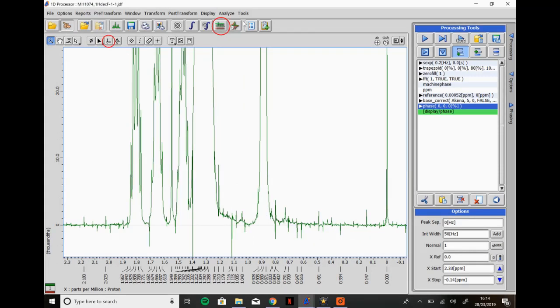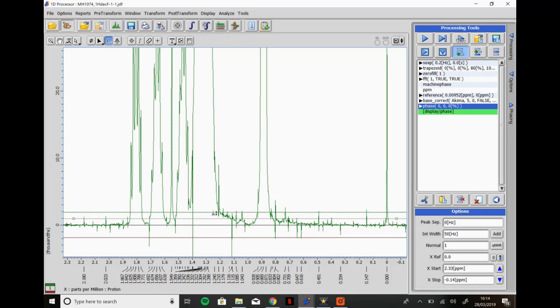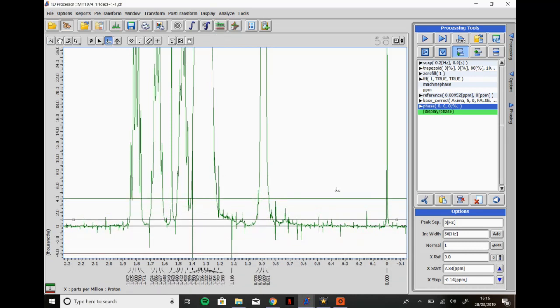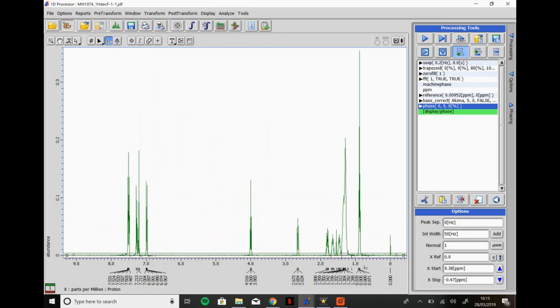Press the Compute and Show Statistic button first to show the lines on the spectra, followed by the baseline button. Move the green line up to the point above which you want peaks to be found, and press the cross button again to show the changes. Integrating is done by selecting the Integrating button on the tab.